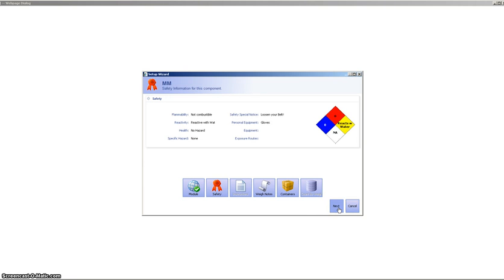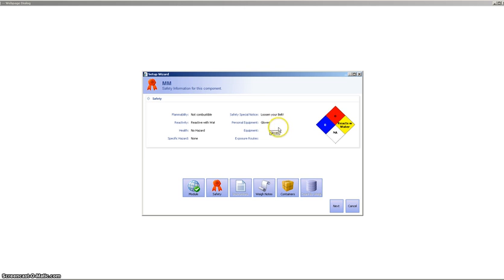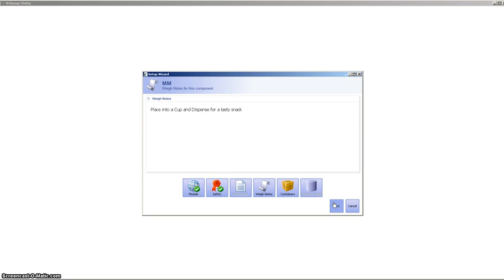We're going to start with safety information, always safety first. And this displays the key elements around the material as well as any information on personal protective equipment that might be required. We've reviewed the safety material information.